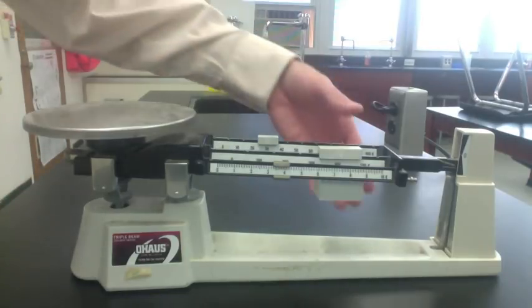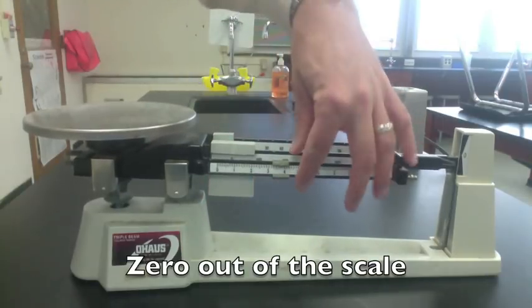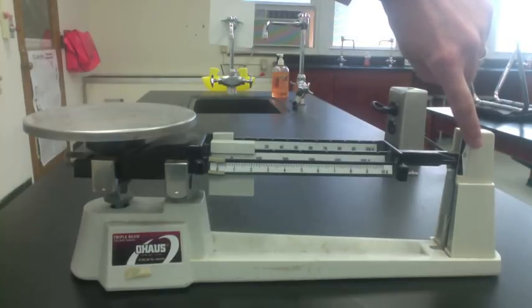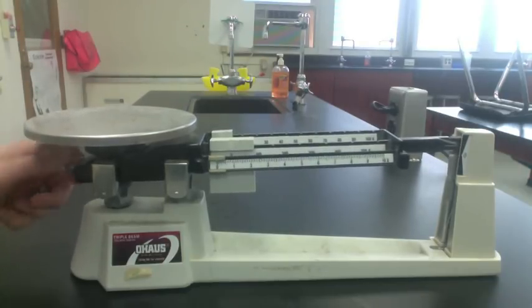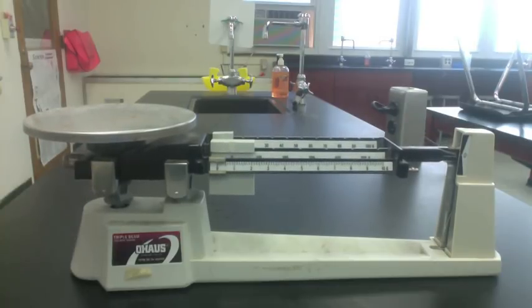To weigh an object, you must first zero out the scale. Put all the riders on zero. However, this won't always balance out the scale — it needs to be zeroed out. So we use the fine adjustment knob on the side. Give it a few turns, maybe a half or quarter turn, until the pointer just balances.